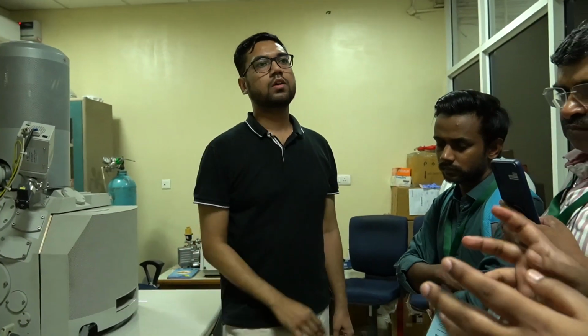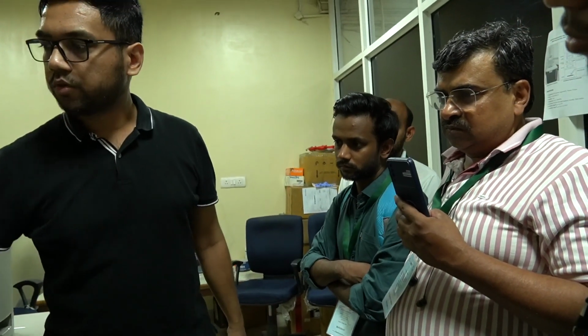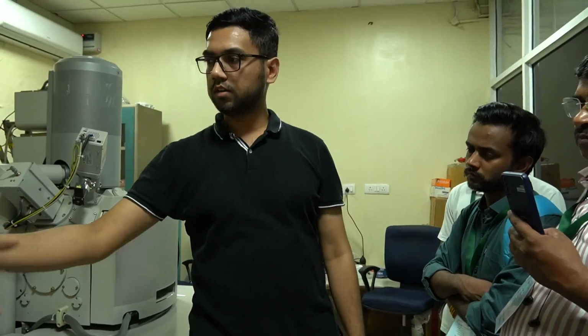So in between the process you do that? No, not in the process. First of all, we have to confirm the nature of our sample. If it is conducting, then we are okay. We just deposit it on the stub and we are good to analyze it. If it is not conducting, then we have to coat it first, then place it. Otherwise, you can start with the scan.